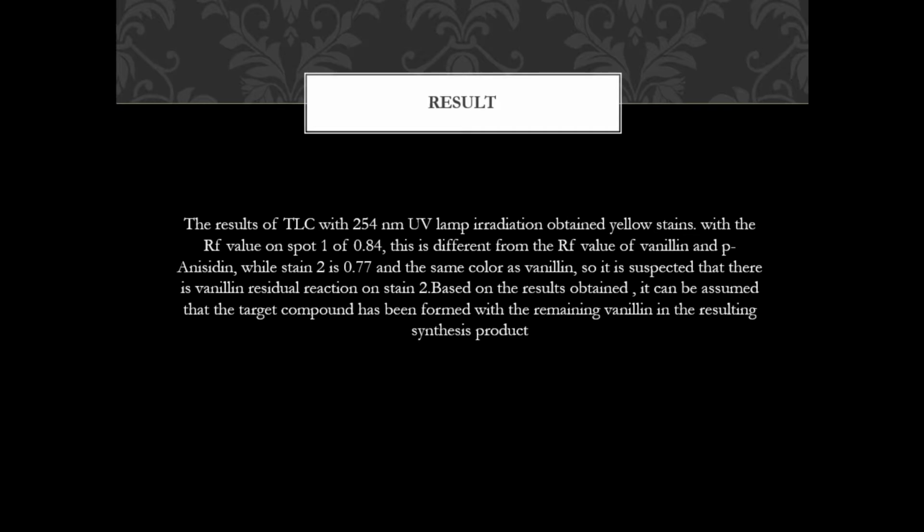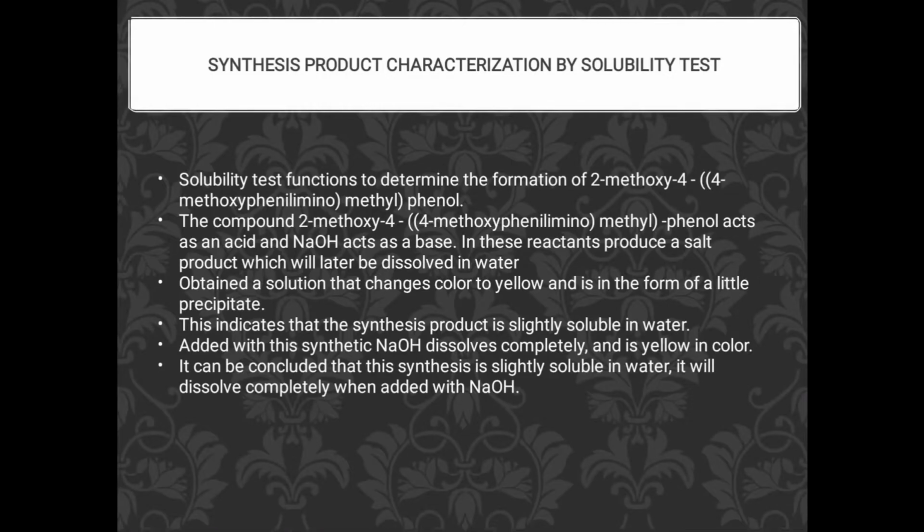Based on the result obtained, it can be assumed that the target compound has been formed, with the remaining vanillin in the resulting synthesis product. Okay, my name is Safira Arila. I will explain about synthesis product characterization by solubility test.